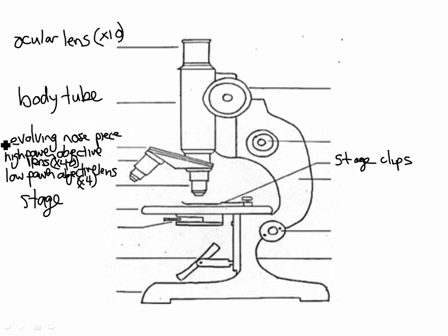All right. Moving down to the next one. What is the next one down there? What do we got? Yep, the diaphragm. If you want to spell it right, you've got to say diaphragm like that, or you will miss the G if you sound it out like I always do. The diaphragm is a specialized device that can open and close, and it allows different amounts of light in. I'll talk about the diaphragm here in a moment.